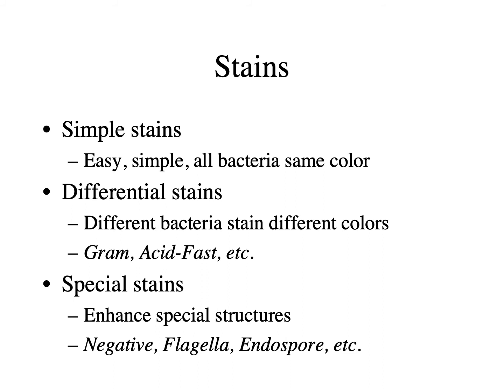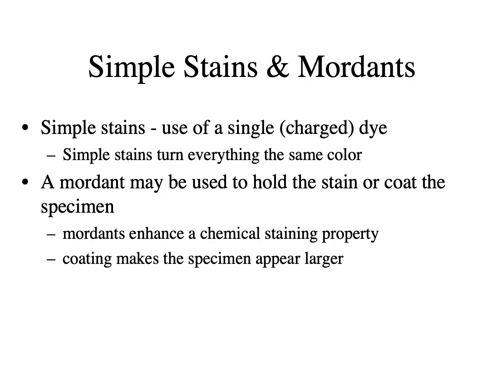We'll talk about those in a second. And then we'll have some cool special stains that you'll learn about that are developed for looking at a particular structure or feature of bacteria. For example, if it makes an endospore, that survival cyst, that is something that is very relevant. So we have a special kind of technique to know whether or not it has that property.